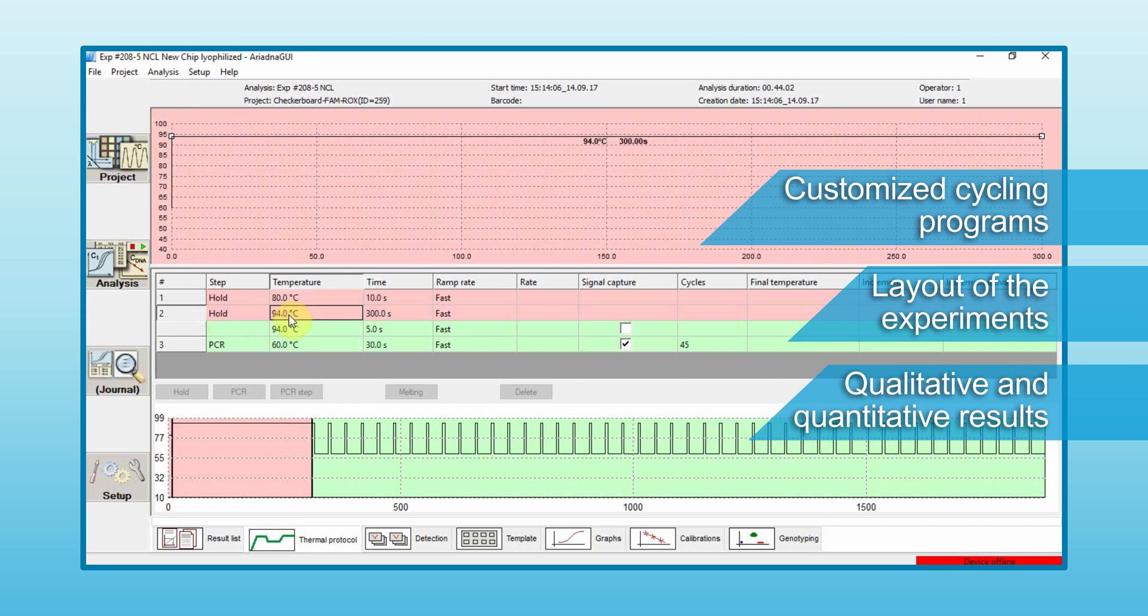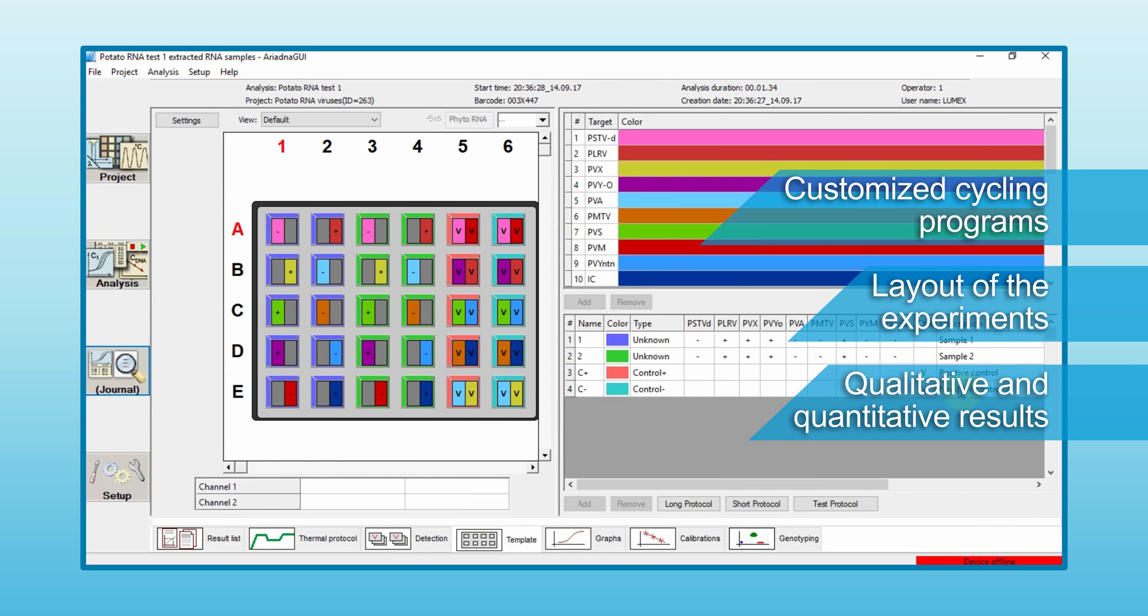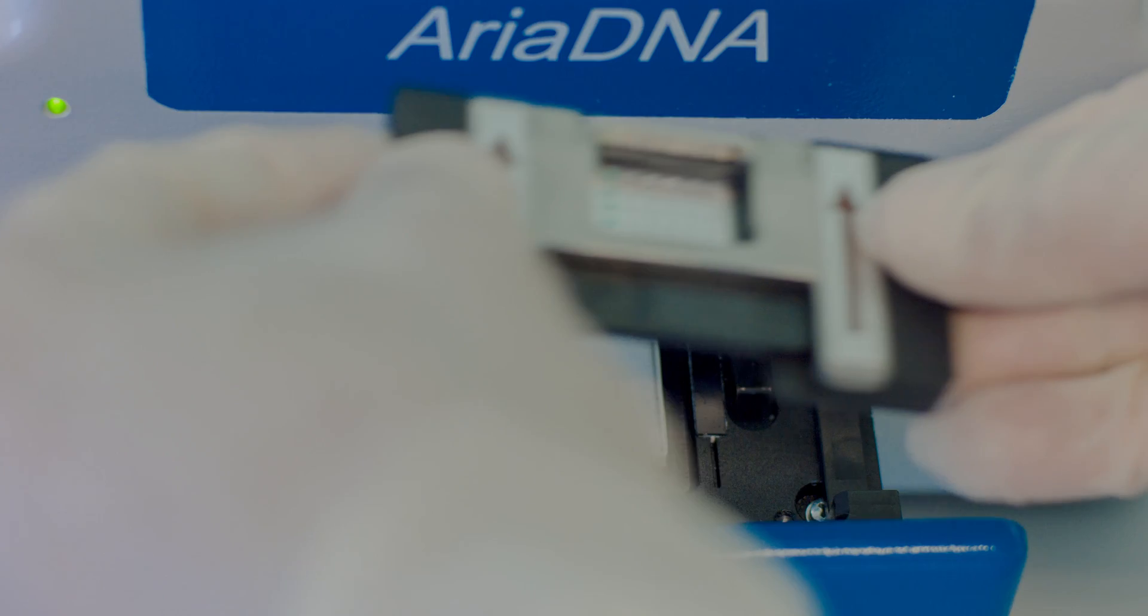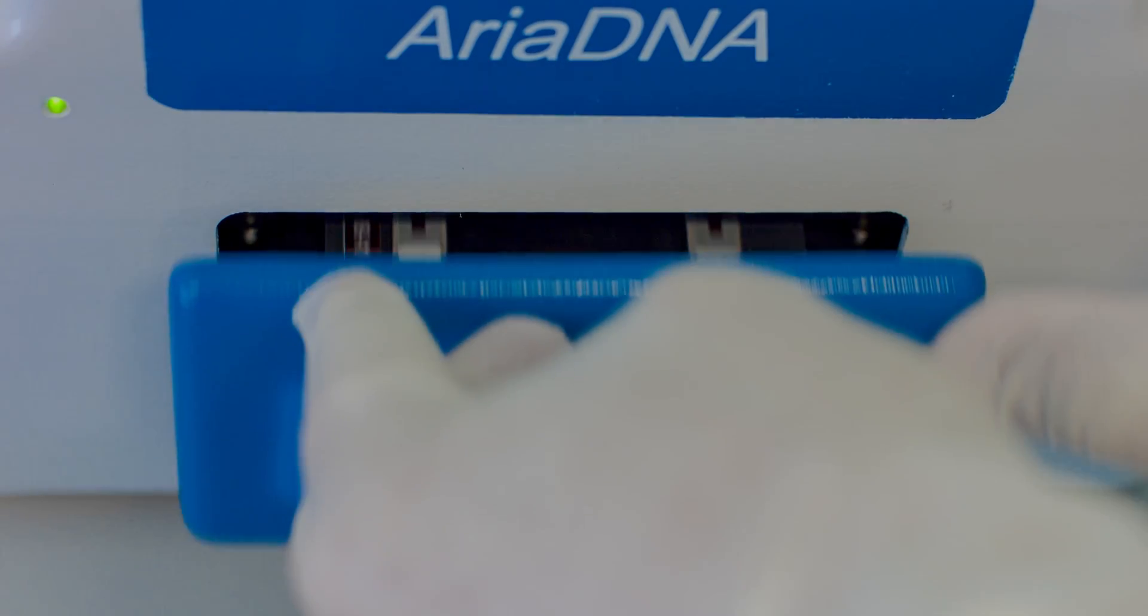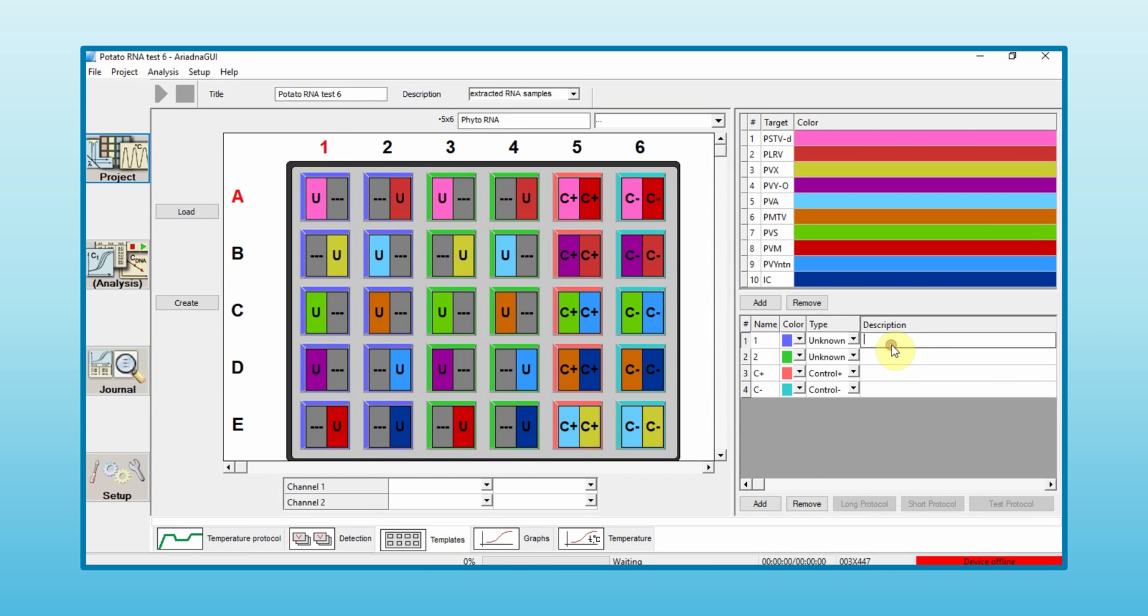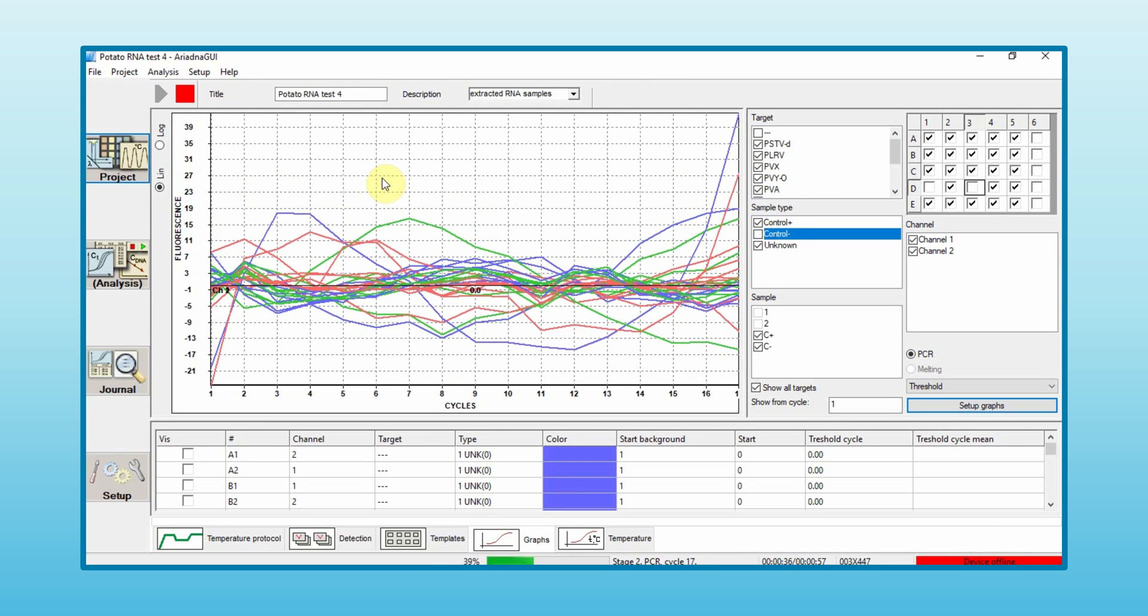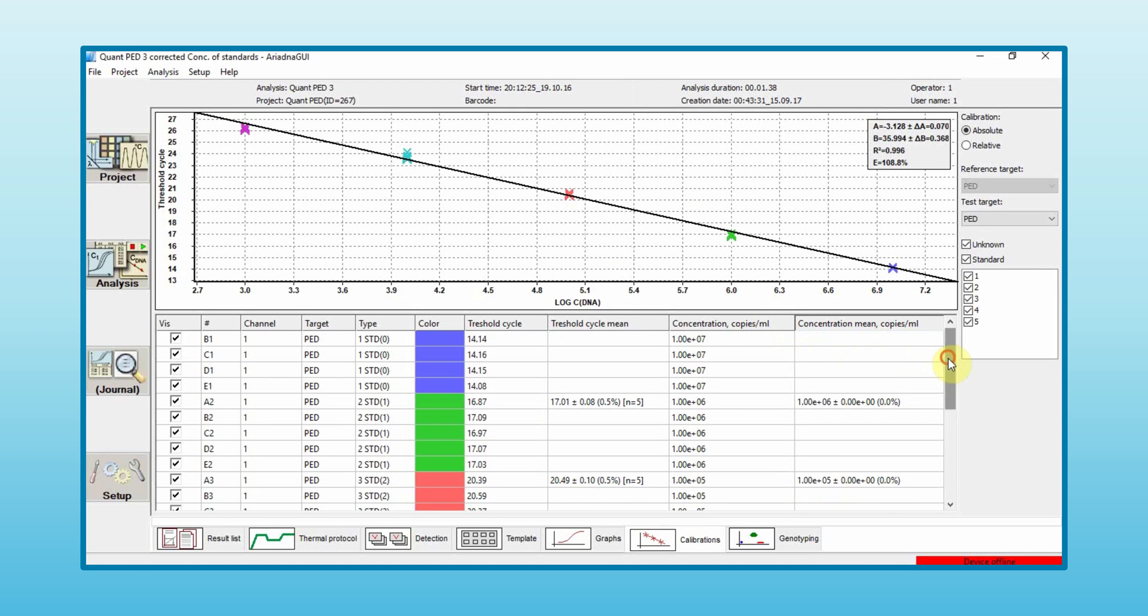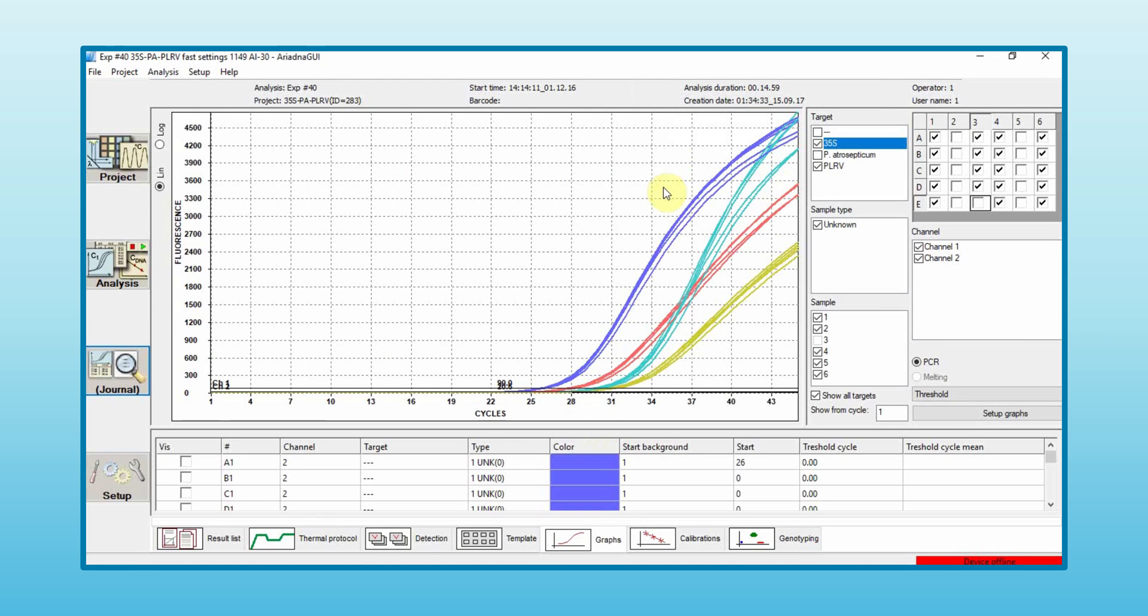ARIANA comes with dedicated software which allows setting various parameters. A user can run dedicated applications coded on a microchip. All that is needed is to insert a bar-coded microchip. The results will show up on the screen representing qualitative and quantitative values of the sample. As you can see, analysis took just 20 minutes.